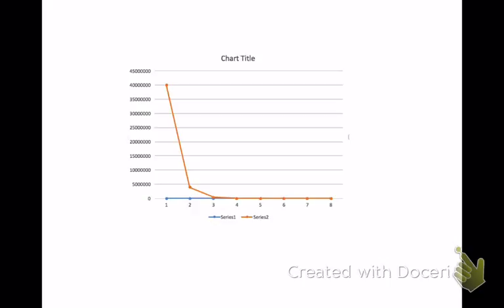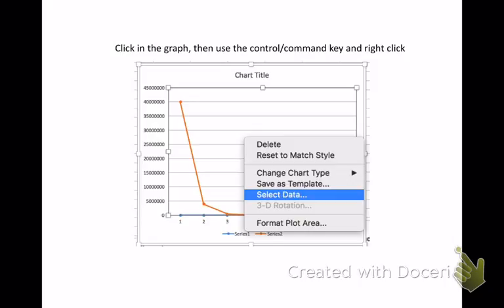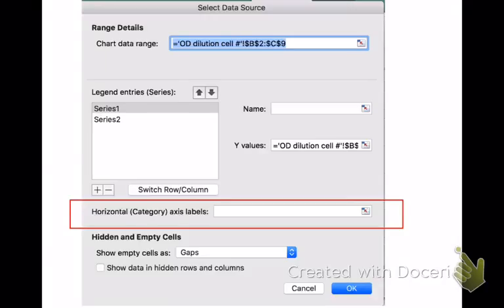This is what the graph looks like after I get it. And you'll notice that all it's giving me is Series 1 and Series 2. The horizontal axis is not correct at this point, so we're going to have to go back and tweak this quite a bit. The first thing that we're going to do is actually click on the graph, and then using your Command or Control key and a right-click, you will get this window, and what you want to do is select data. That's how we're going to be able to go in and manipulate Series 1 and Series 2, and we'll be able to change the X-axis.